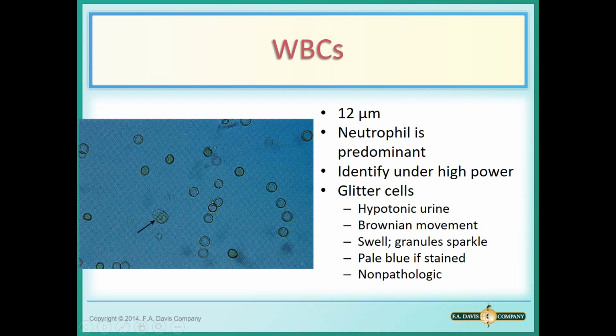Here's a red blood cell. I'm assuming, let's say there's a red blood cell. Here's a white blood cell. The white blood cell has more content in it. Remember, the red cell does not have a nucleus in a mature red blood cell, but the white blood cell will. Many white blood cells have some granules in them. Those neutrophils, eosinophils, things like that have granules in them. So there are different kinds of nuclear shapes that we're going to see, as well as granulation.